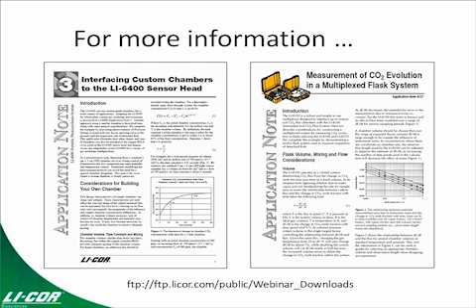you can't make the measurement. Well, and the other thing you can do is you can actually use the analyzers to make just a subsampling measurement, as Jason pointed out. And if you remember back to that circular chamber with the 2 fans, if you've got a system that actually measures the flow rate in and has adequate mixing, you can have theoretically very, very large chambers in the order of 10 square meters.